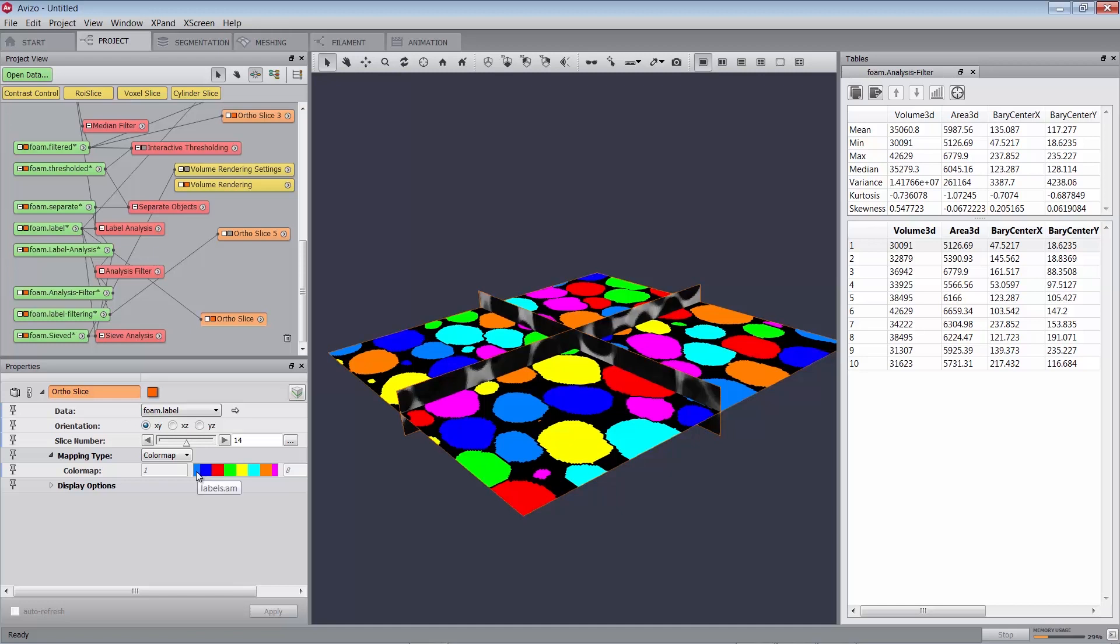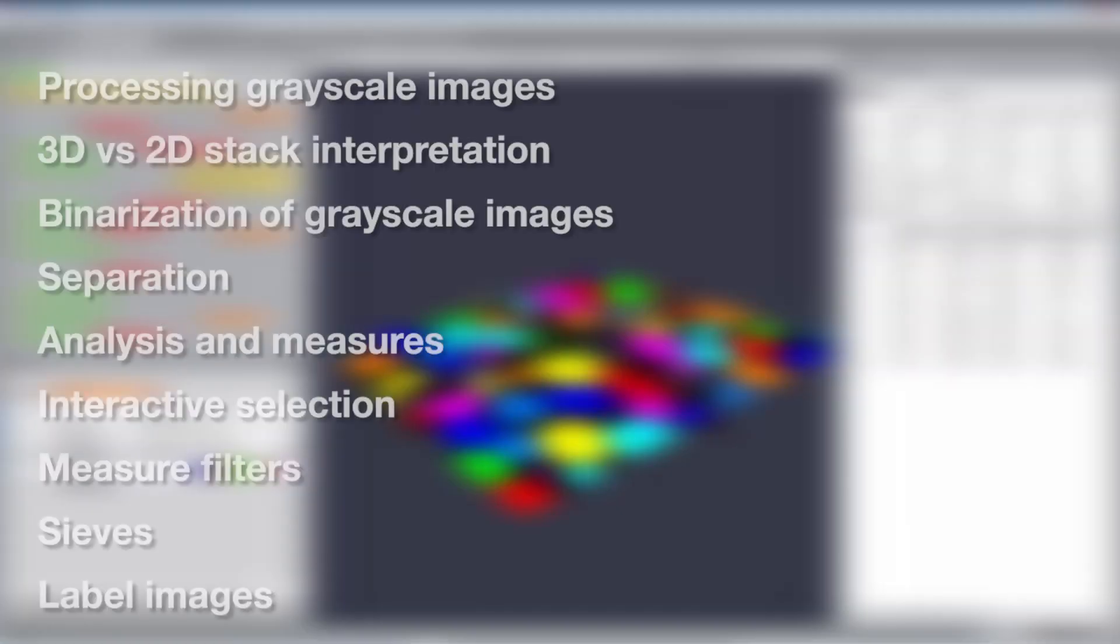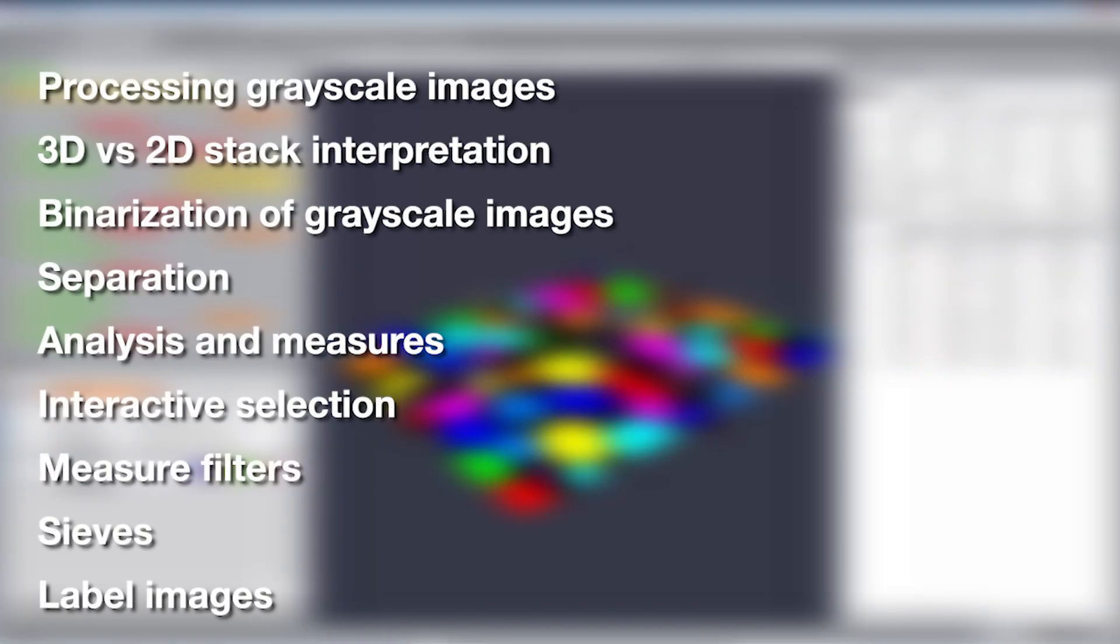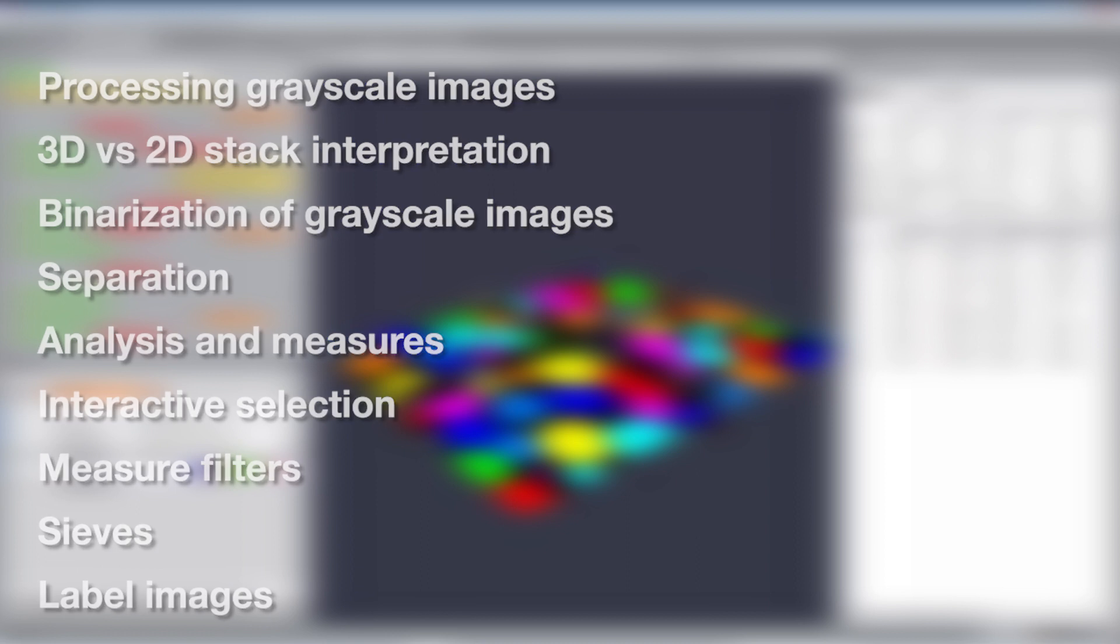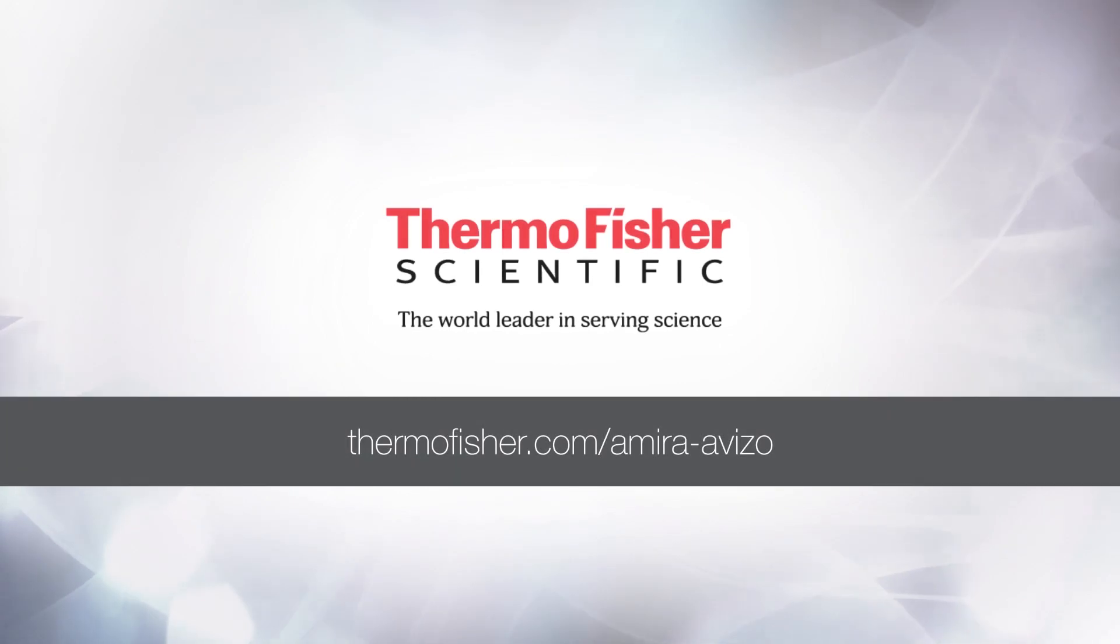As a summary, this tutorial has introduced you to processing grayscale images, 3D versus 2D stack interpretation, binarization of grayscale images, separation, analysis and measures, interactive selection, measure filters, sieves, and label images. Goodbye, and thank you for viewing this tutorial.